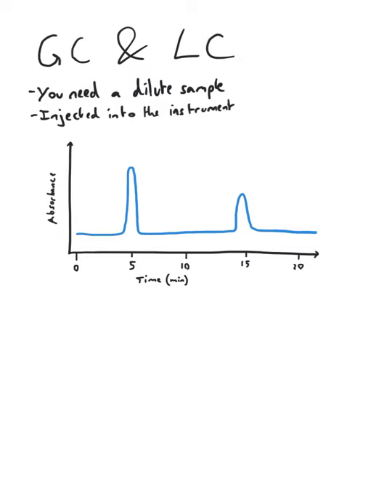It is your time towards your absorbance, and you will notice that some peaks will appear. Think of this as a TLC plate on its side, and those peaks are your spots. As long as your conditions remain the same, a compound will appear at the same time.